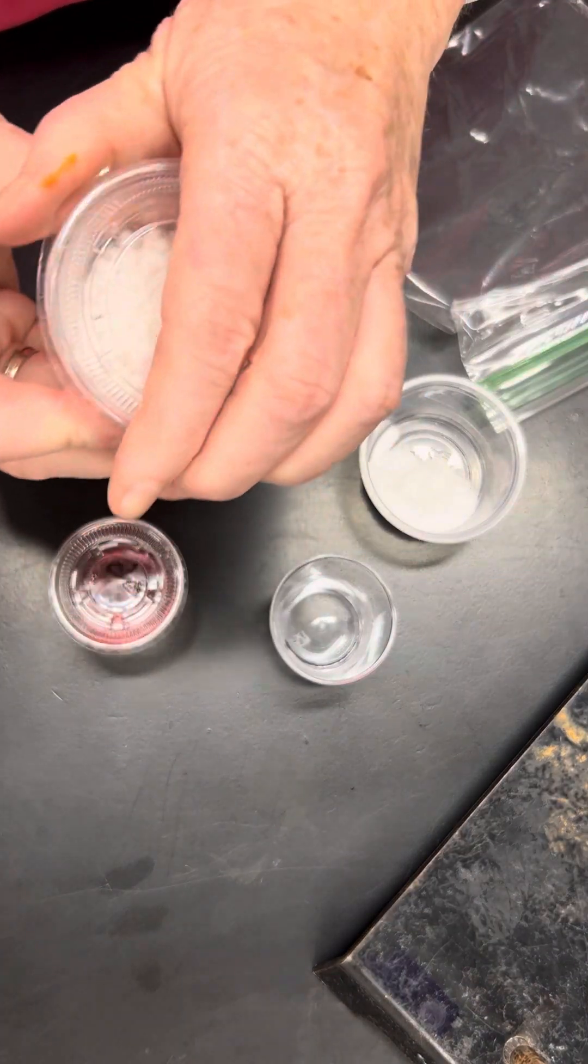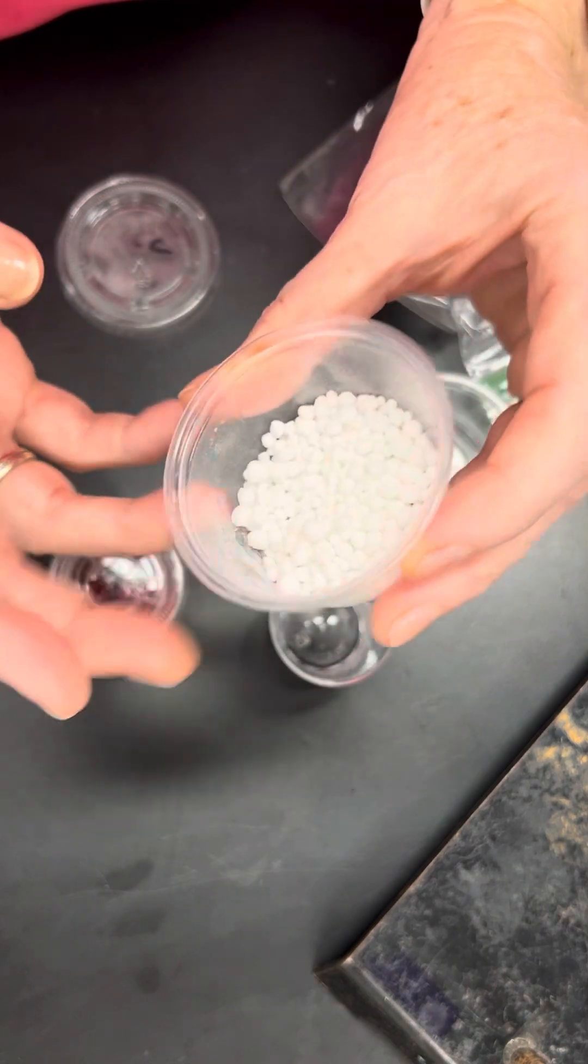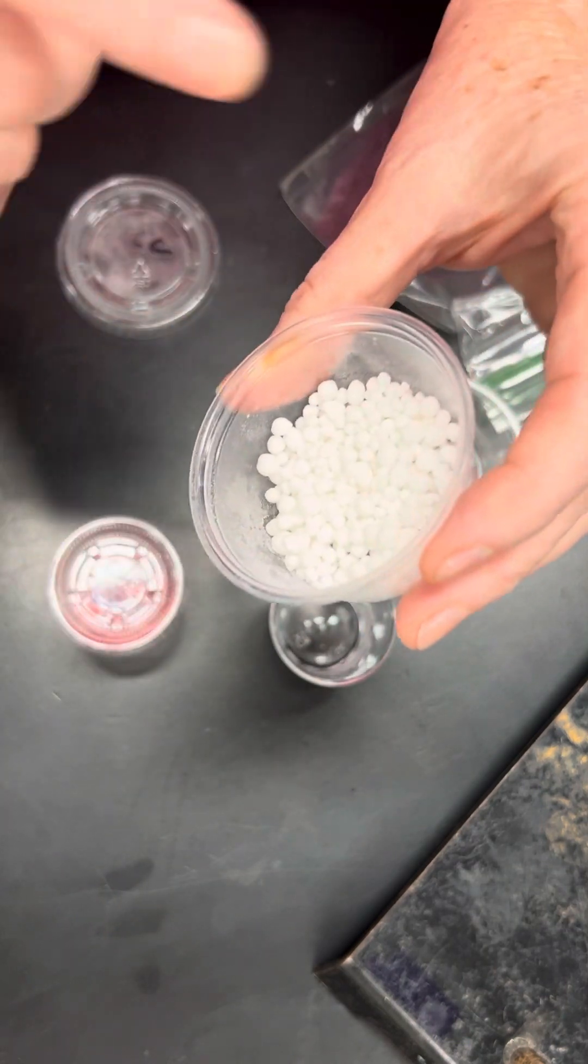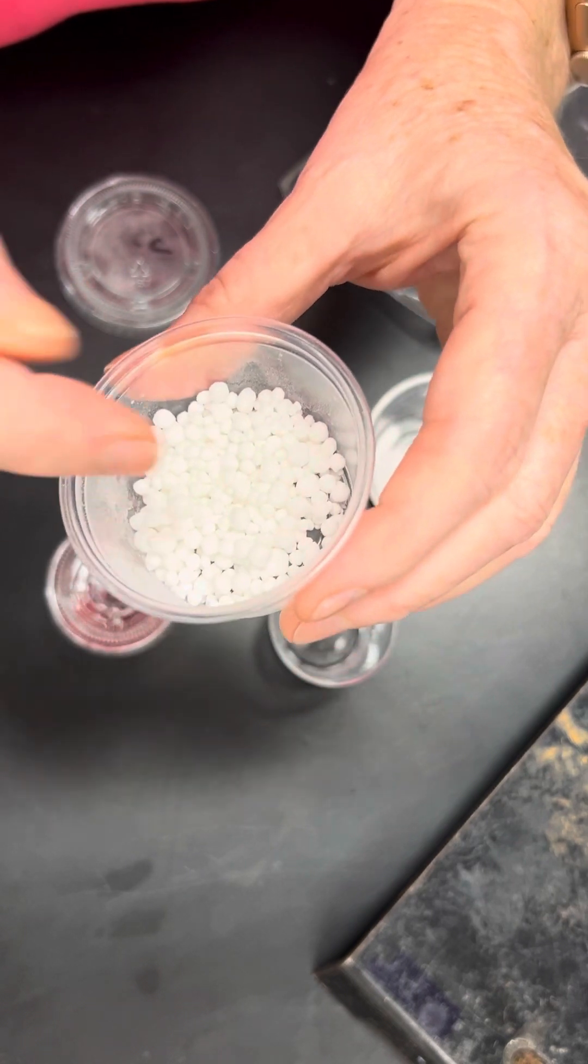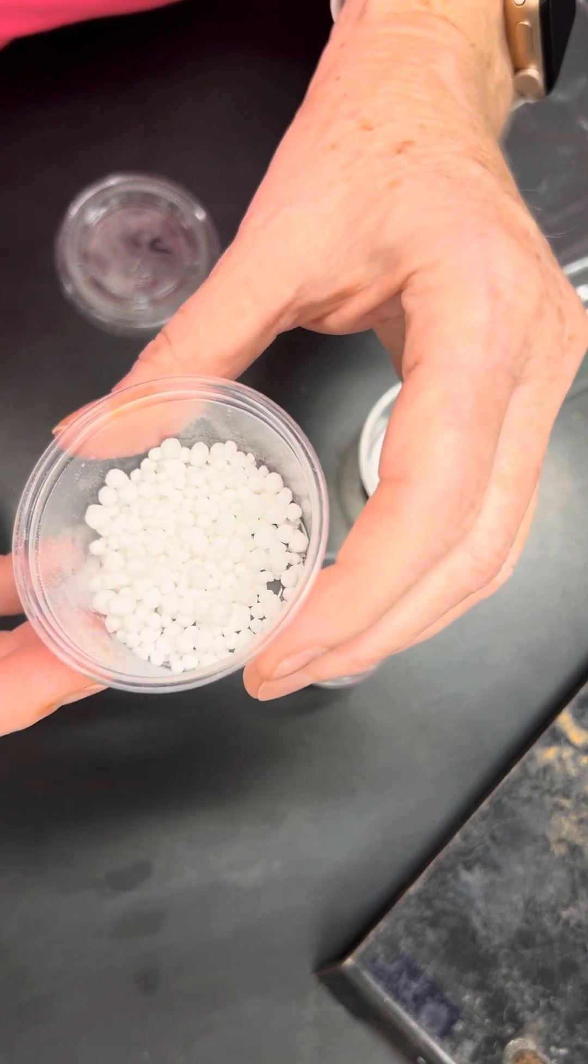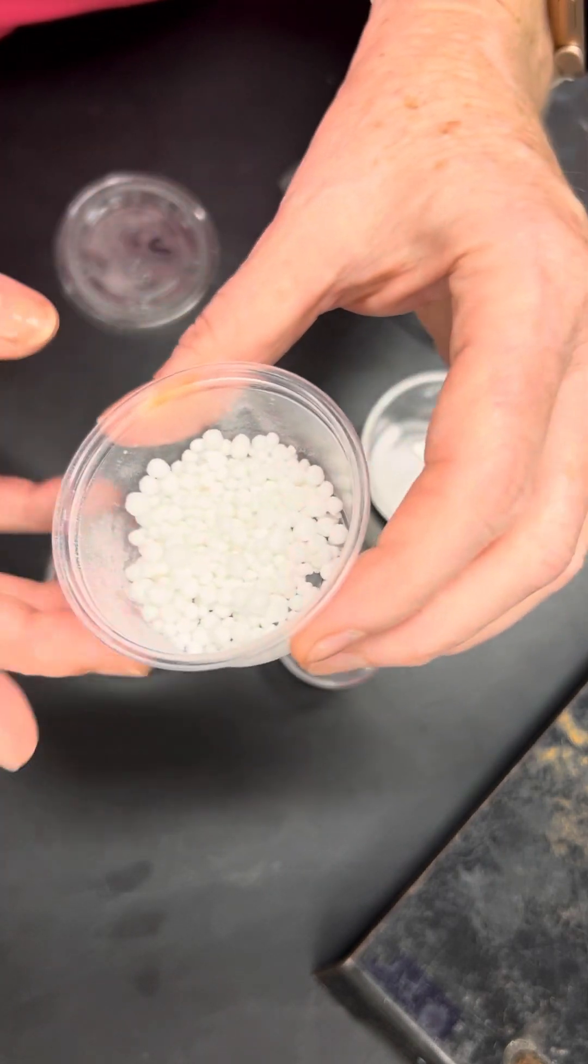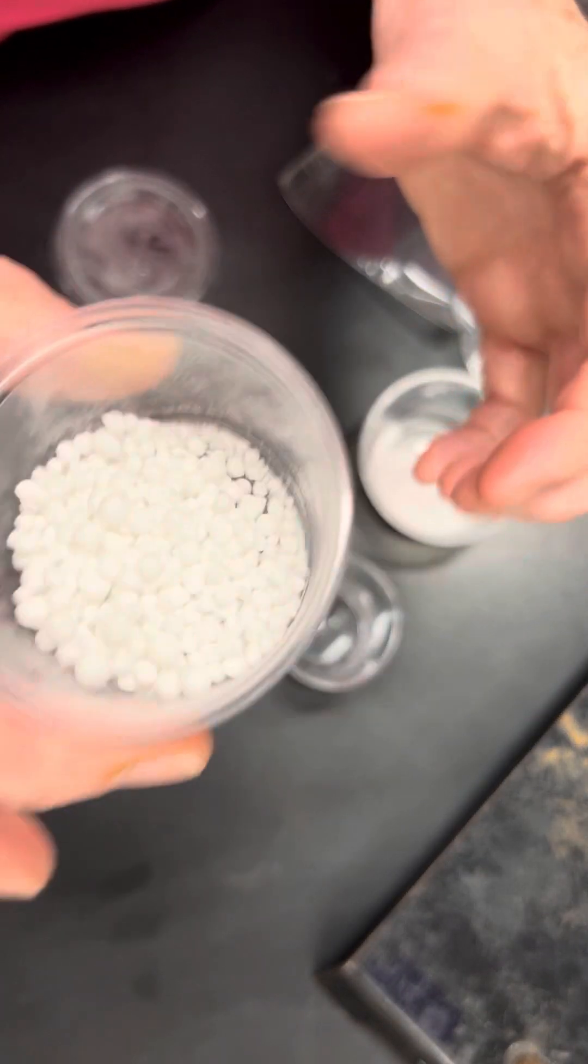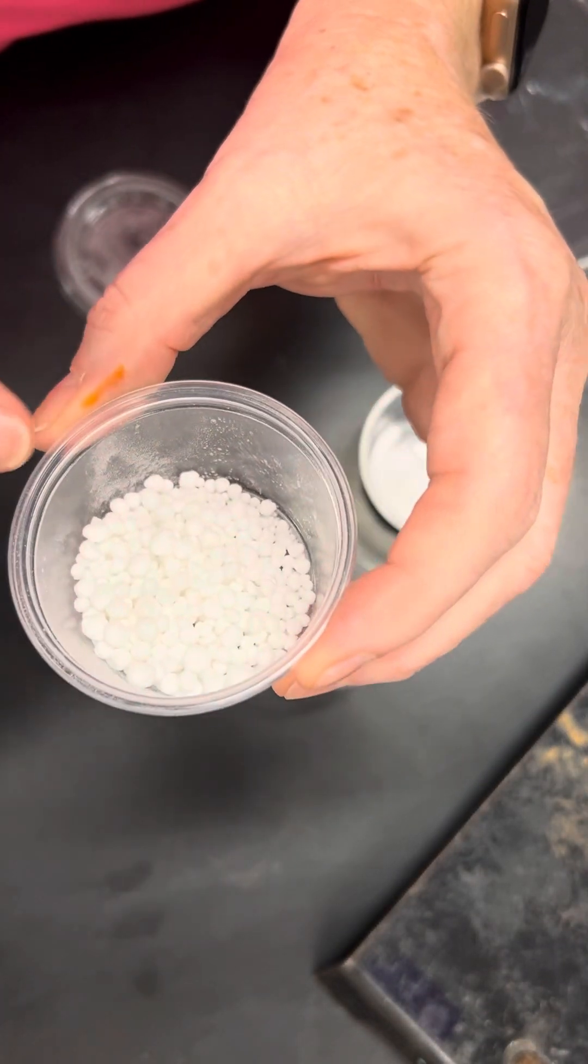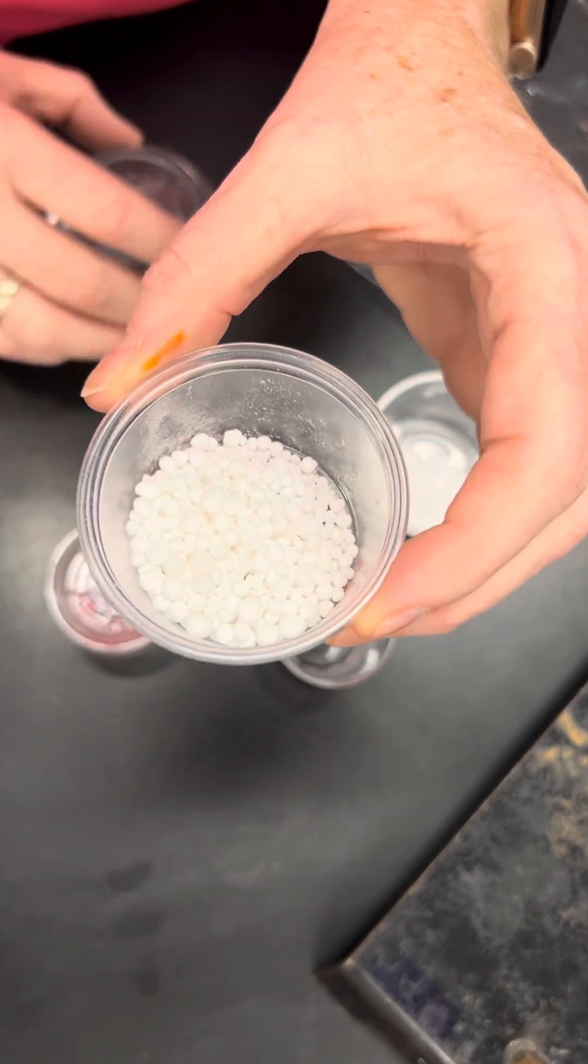Substance number two is CC or calcium chloride. It is also a white solid, but instead of being powdery, it's more like Dippin Dots or like little baby snowballs. I would call this chunky or clumpy versus powdery. It makes a little sound when you move it around, and it is toxic to human beings.